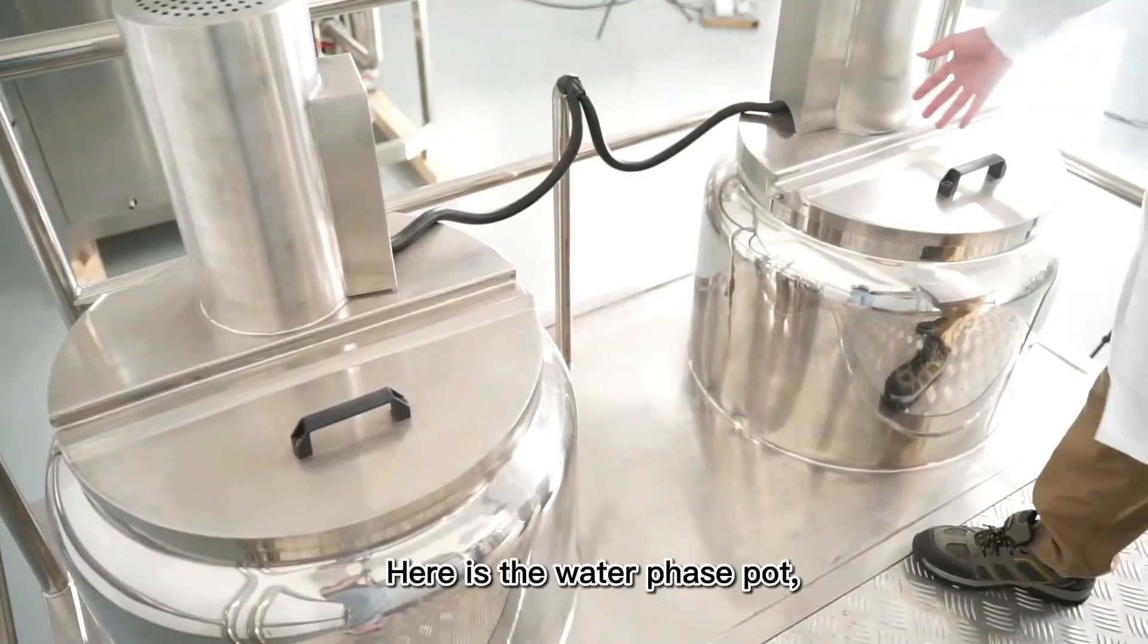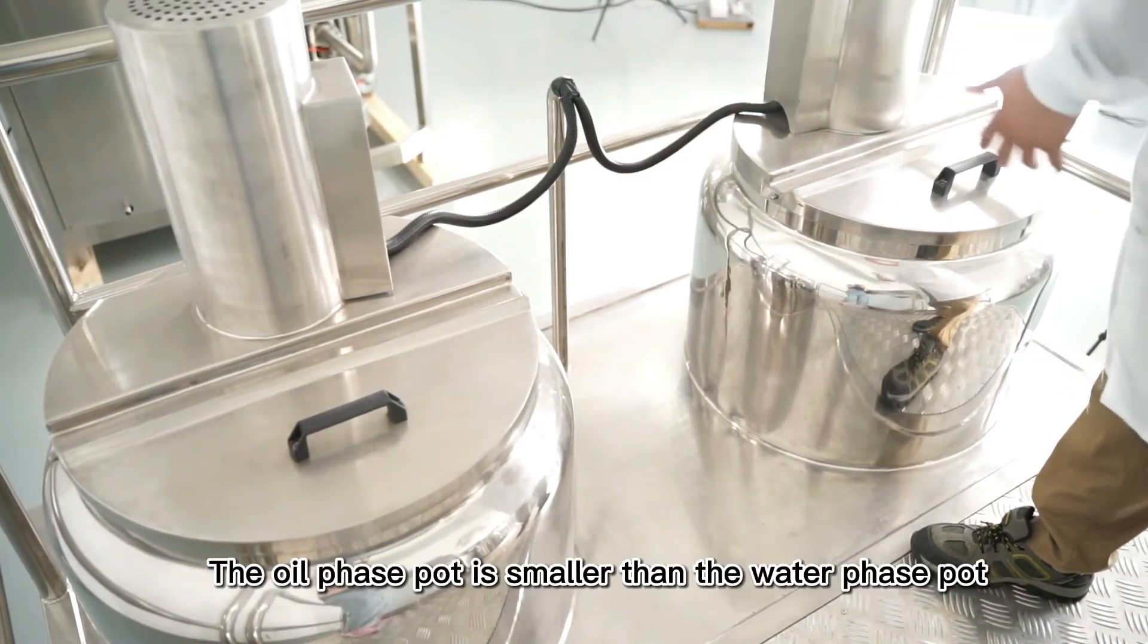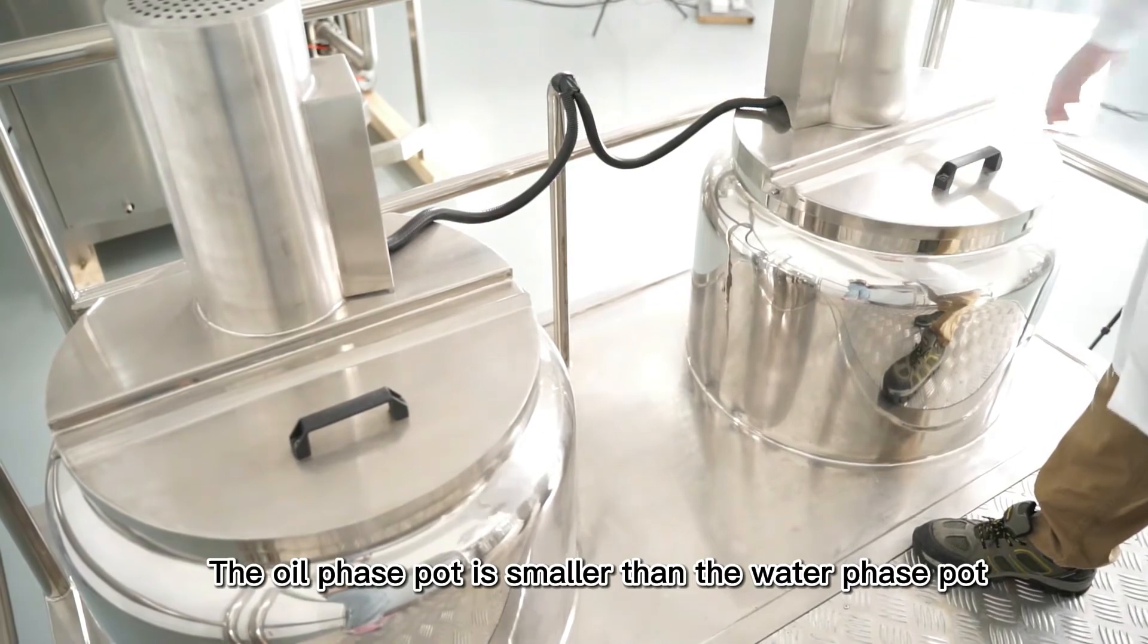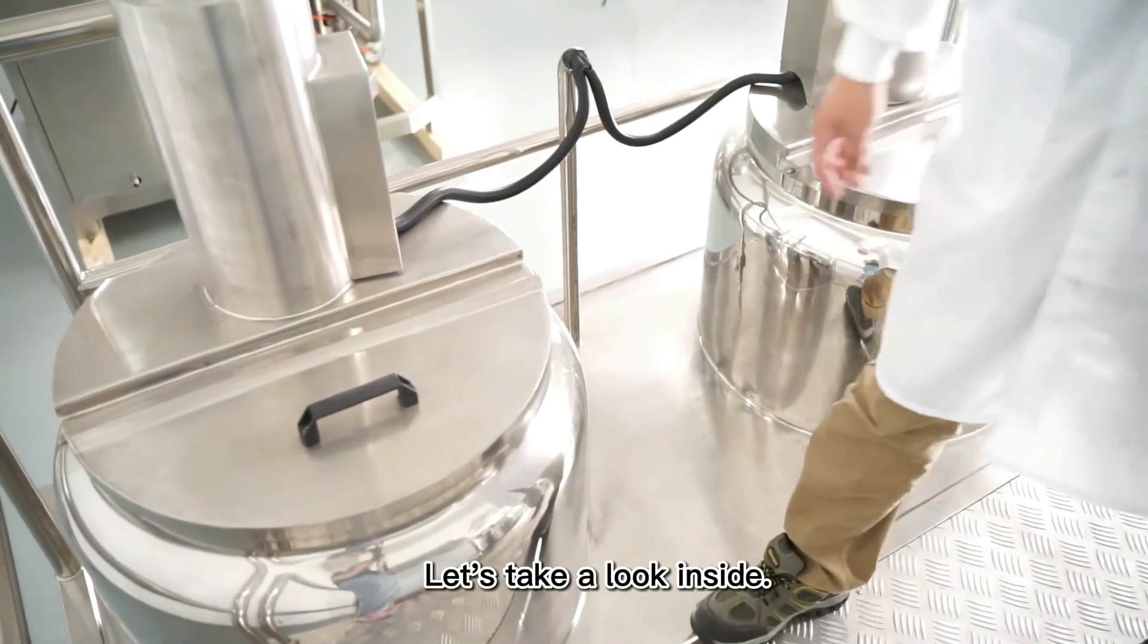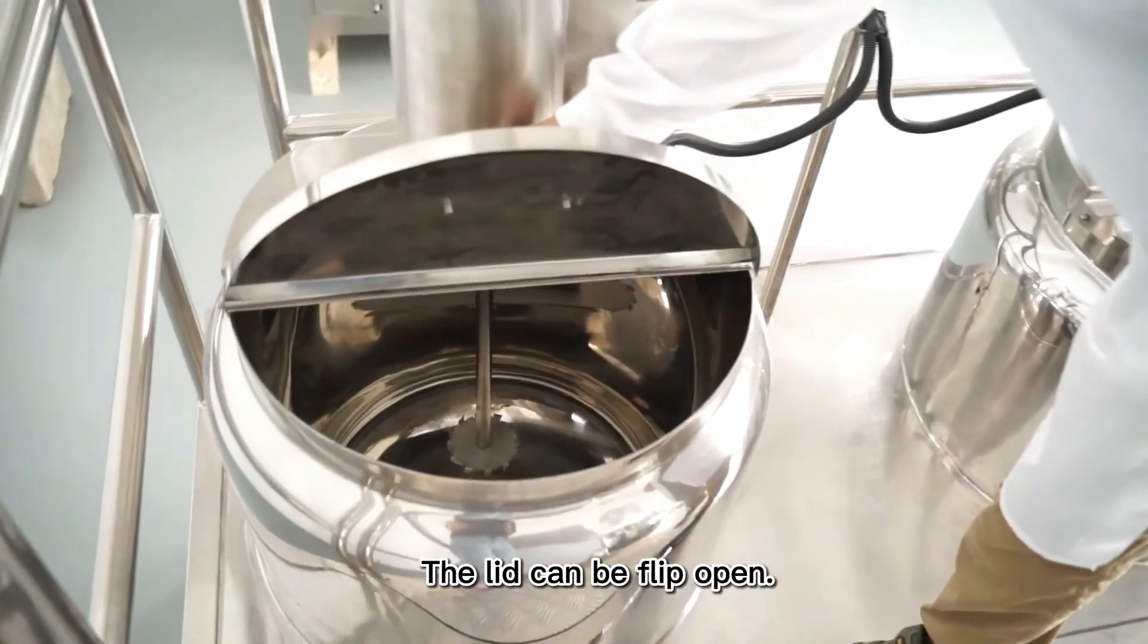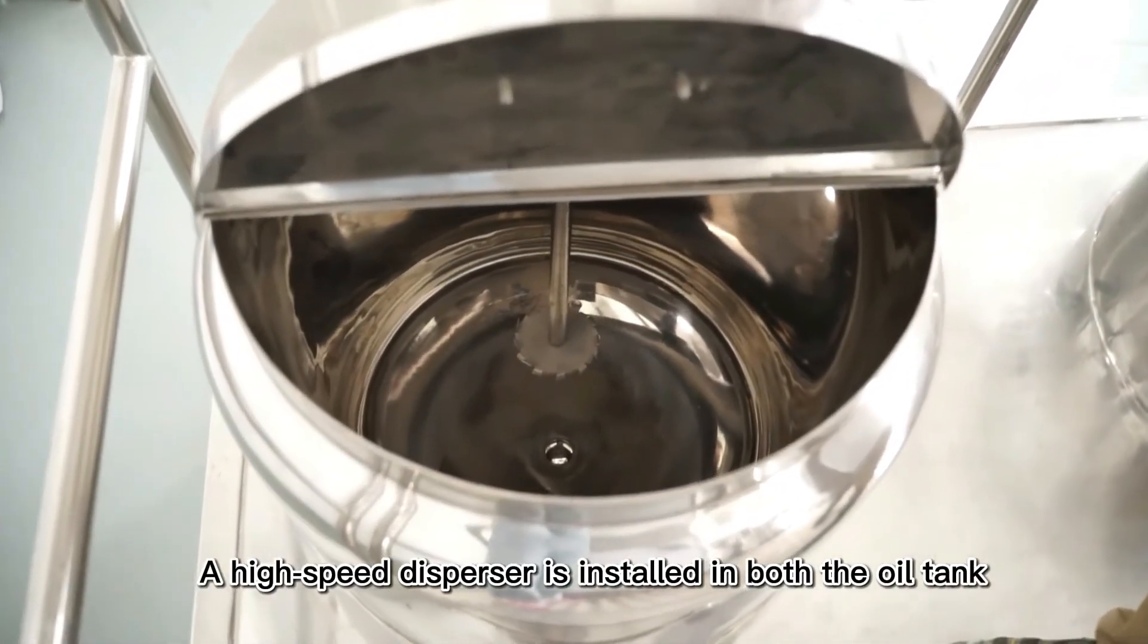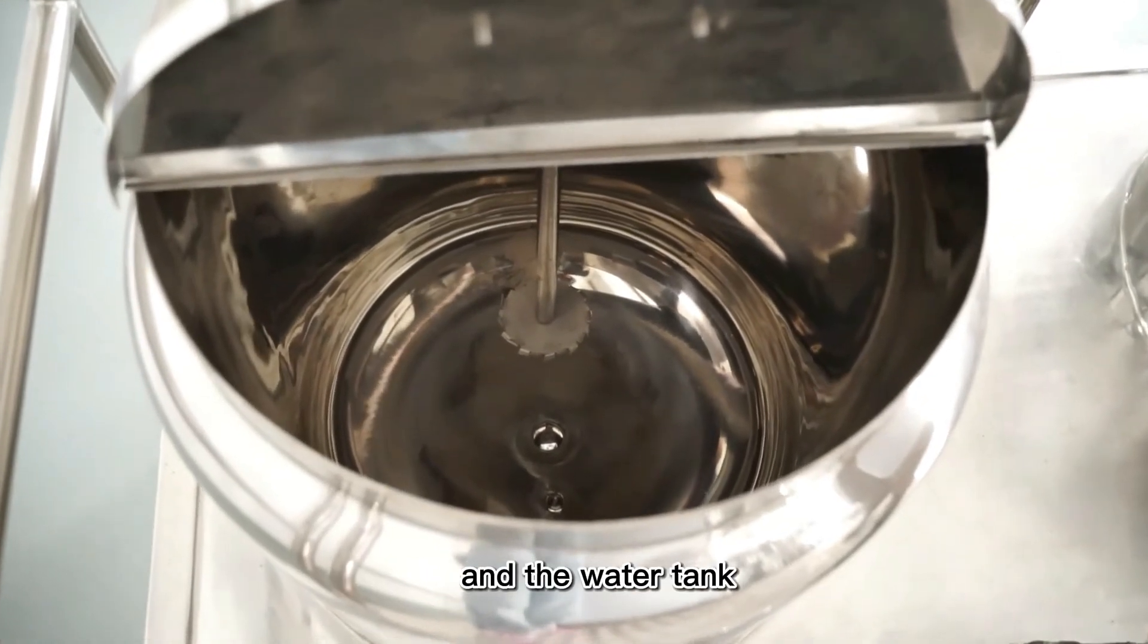Here is the water phase part, and here is the oil phase part. The oil phase part is smaller than the water phase part. Let's take a look inside. The lid can be flip-open. A high-speed disperser is installed in both the oil tank and the water tank.